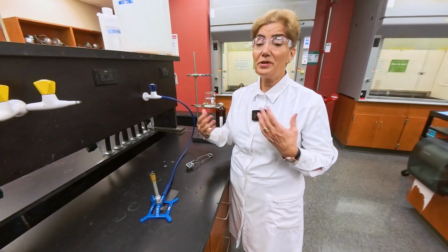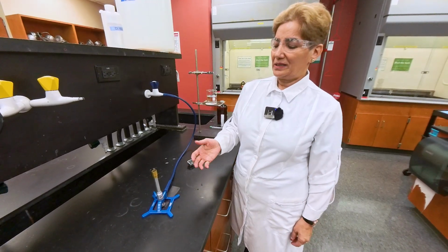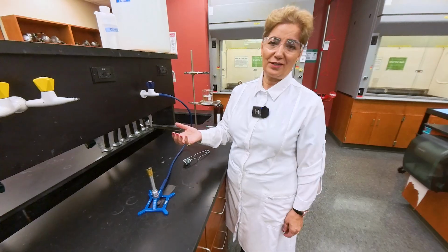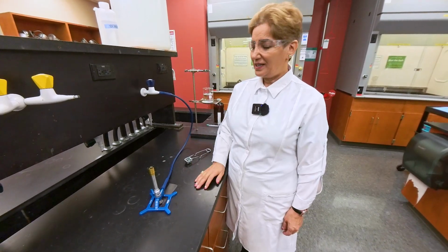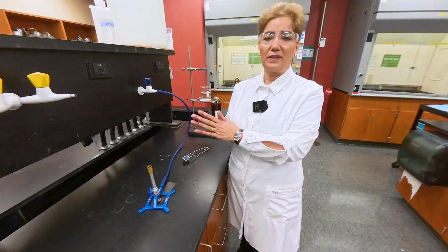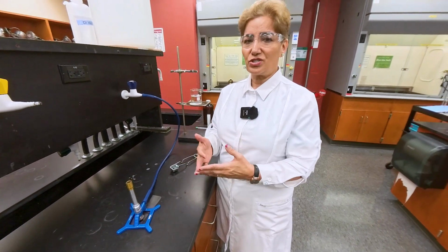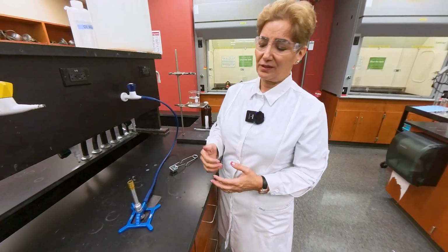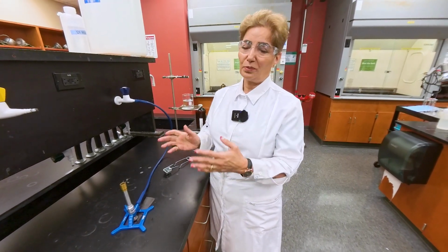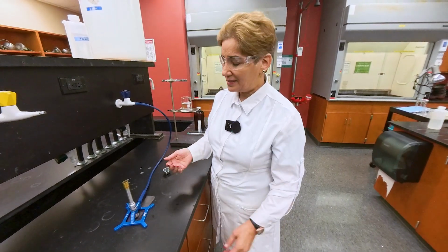Of course, there is a chemical reaction going on, and one of the byproducts of that chemical reaction is the flame that you see, which is the heat that is generated. This chemical reaction is natural gas reacting with oxygen and producing heat and flame. The products are water and carbon dioxide.